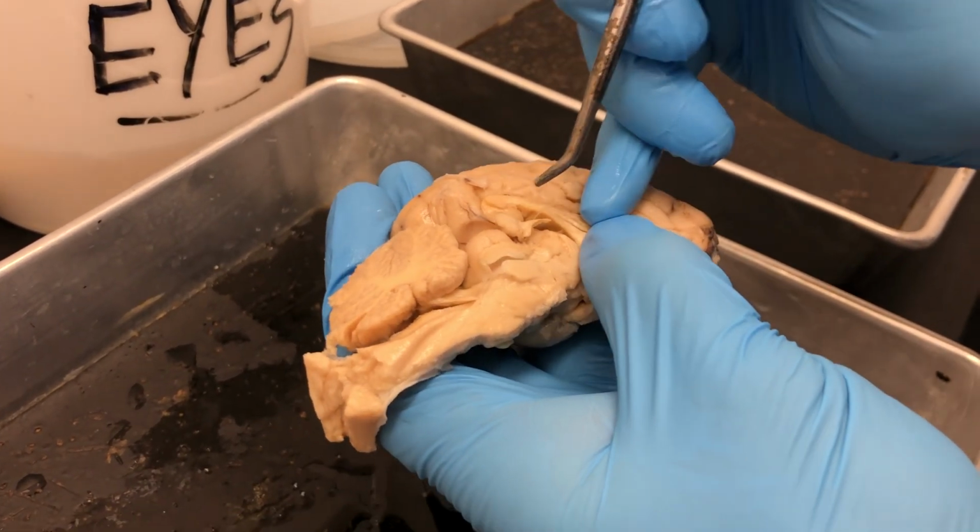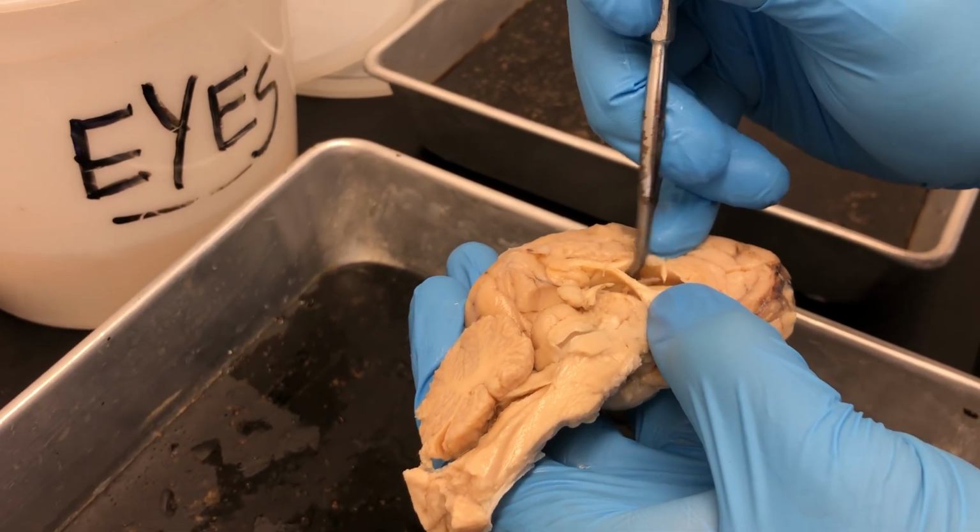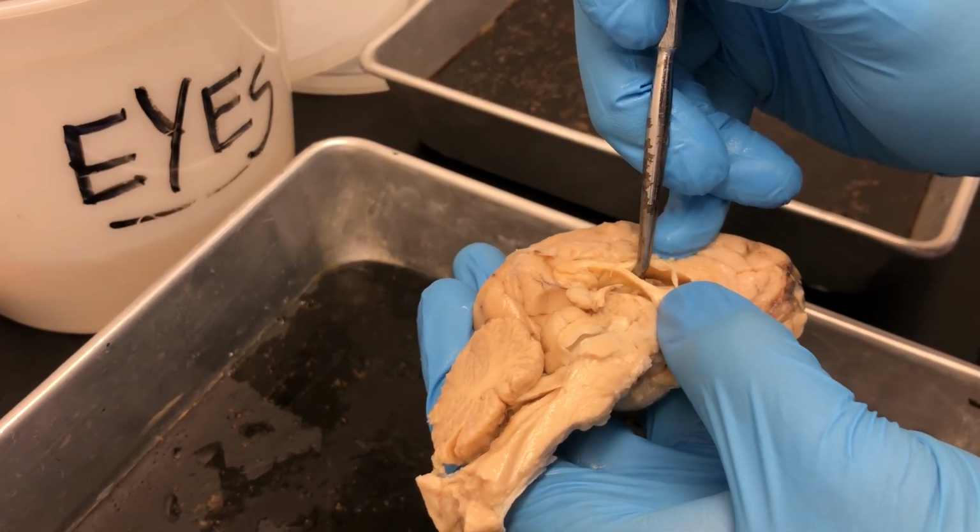Next we have the lateral ventricle. That's where I actually open this up. This open space in here is the lateral ventricle.